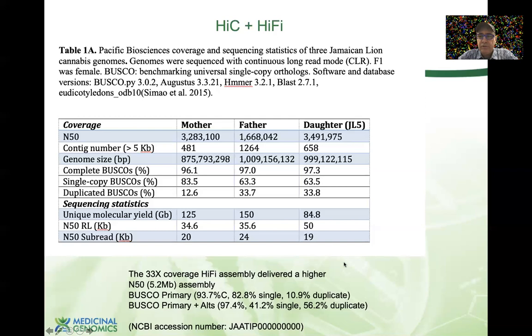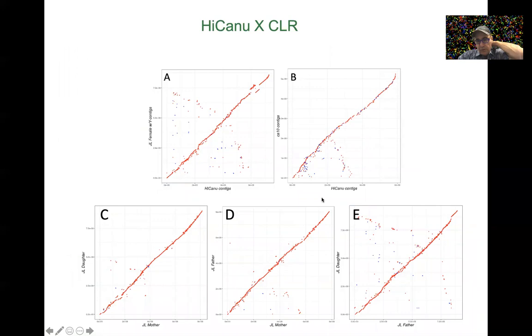So this HiFi assembly is actually public, and we're going to go through some of it. There are some interesting features about it. This is the HiFi HiCanu assembly actually aligned against CS10. This is another reference that was done many years ago. It's also in NCBI and it's nicely annotated.